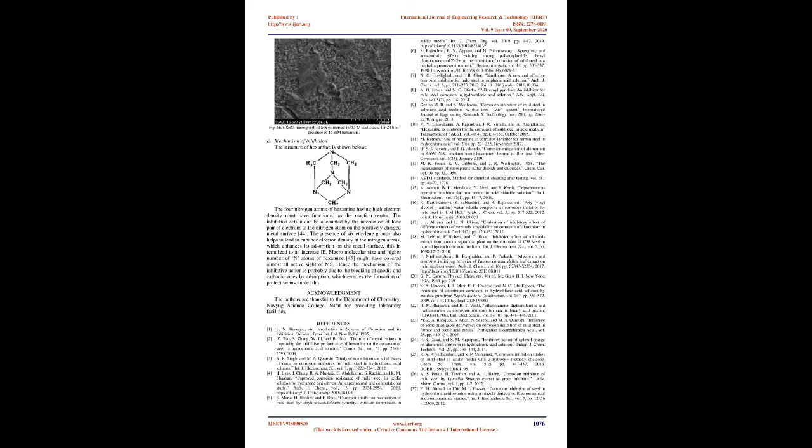From the EIS spectra, the electrochemical behavior of the system is interpreted. A high RCT value of 18,643.10 ohm cm² was observed in the presence of hexamine at 15 mM concentration, while the RCT value was 56.22 ohm cm² for uninhibited acid. The CDL value decreases from 145.00 µF/cm² to 0.0025 µF/cm² in the presence of hexamine, Table 8.